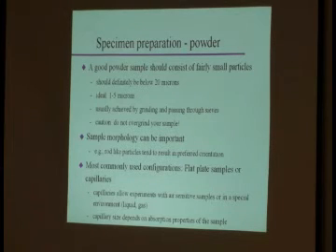Capillaries give you some benefits. You can actually protect the sample from air. You could actually run a sample in a mother liquor, for example, for proteins, okay? Special environments. Of course, what you need to watch out for is what's the absorption of your sample, because now you go through the capillary, okay? If you have a sample with heavy elements, you need very, very narrow capillaries, and that's no fun to pack. If you have something organic, capillaries are actually quite easy to handle.